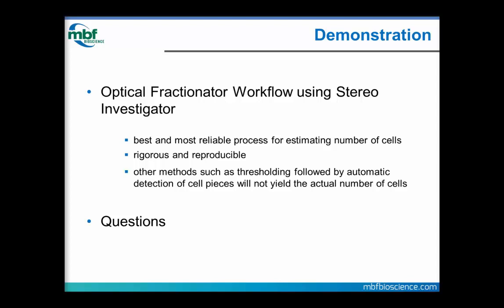There are other methods out there, such as setting a threshold at low magnification to detect the number of cell pieces. That's not what this webinar is about today. This webinar is about estimating the number of actual cells. And then we'll stop for questions after that.